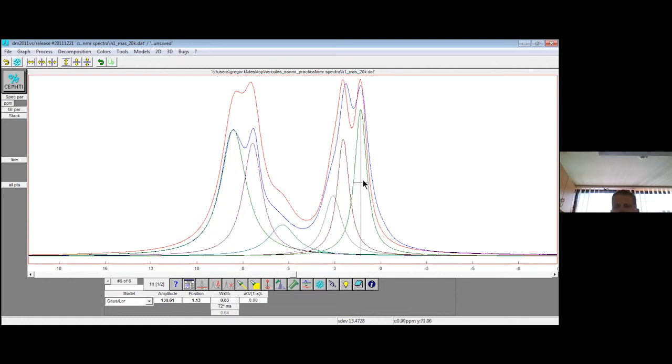There are two cursors, this cross here, that tell me for which line I see the boxes here. I see the values for the sixth line added. If I use these arrows, I can move to the fifth, fourth, third, second, first line, okay? And I can modify these values if I want.